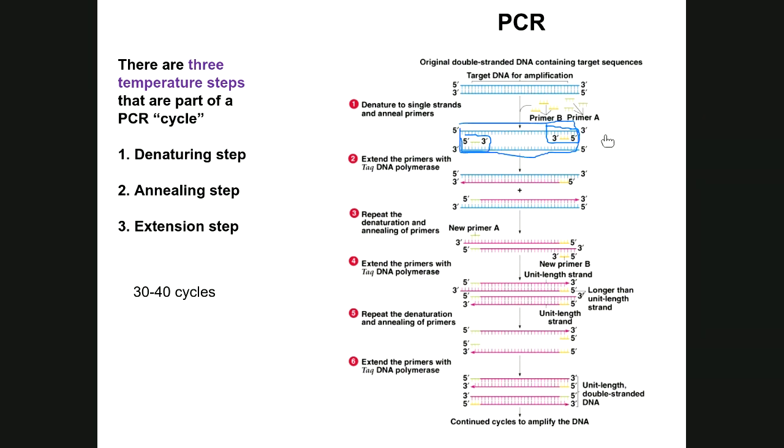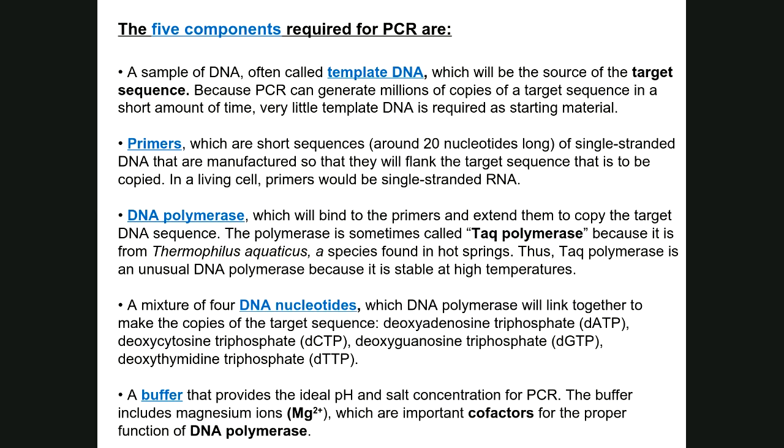These primers are responsible for recognizing your target sequence, your target DNA. But they have to bind where you're able to make copies of that target DNA. Make a large quantity of copies, therefore making it easier to see your DNA through a different type of technique that we'll talk about next week to verify or determine if your food source is from a GMO. Now, these primers are also in solution in a buffer.